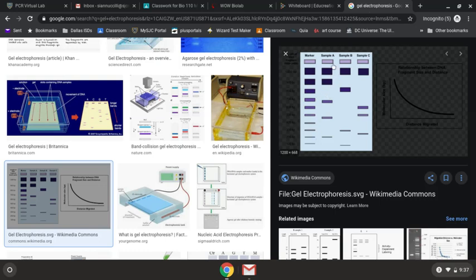So here, sample A, we can say that this was the ex-girlfriend for argument's sake. Her DNA was cut into 1, 2, 3, 4, 5 pieces when we added that enzyme. This person, 1, 2, 3, 4 pieces of DNA it was cut up into, because this person's DNA is different. So that enzyme is going to cut this person's DNA differently than this one's. And then sample C, 1, 2, 3, 4. The same number as B, right? B has 1, 2, 3, 4, but the sizes are different. Actually, those might be the same, right? The first DNA piece between A, B, and C are all the same.